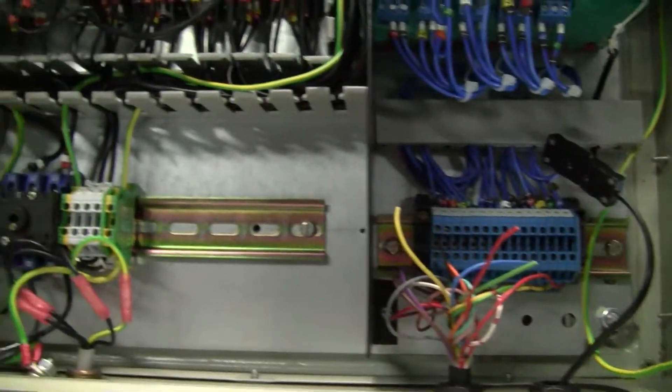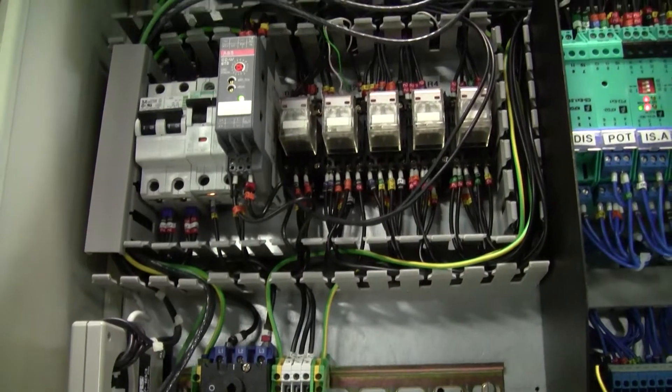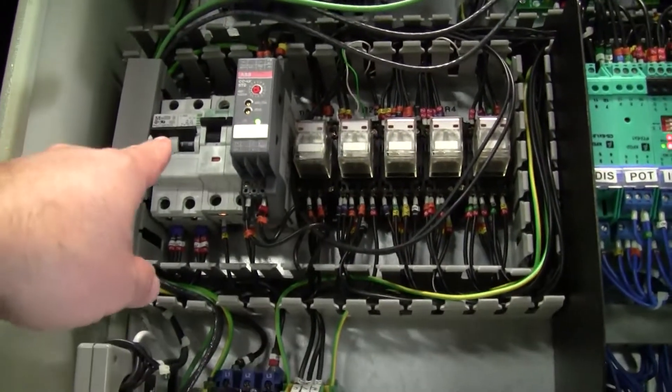Not that bad. The unit runs on 220. Main fuses.